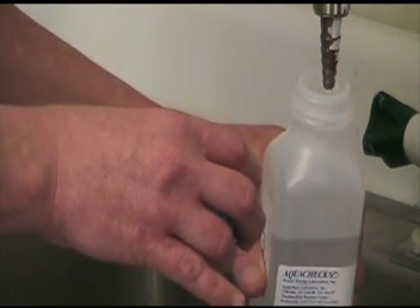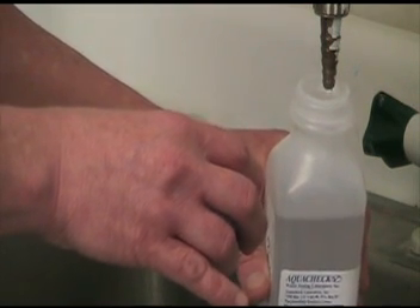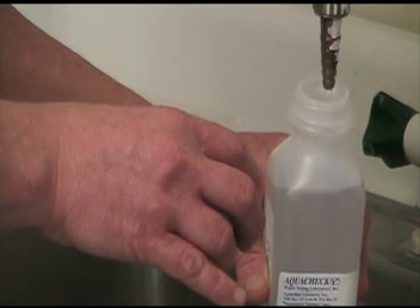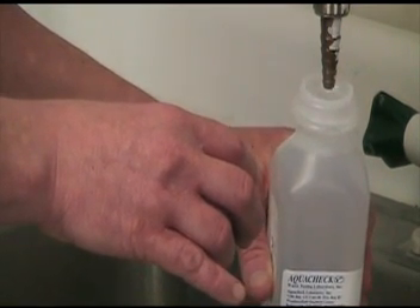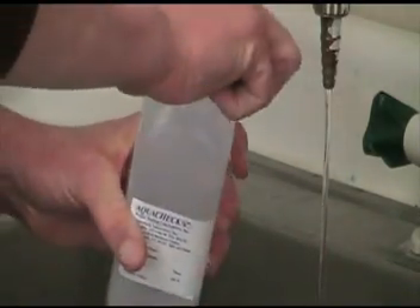Mark the sample container with your required test, the date and time of sampling, as well as sample location and sampler name. During transport to the lab, try to keep the sample in a dark place to reduce algae growth, which can increase the sample turbidity.